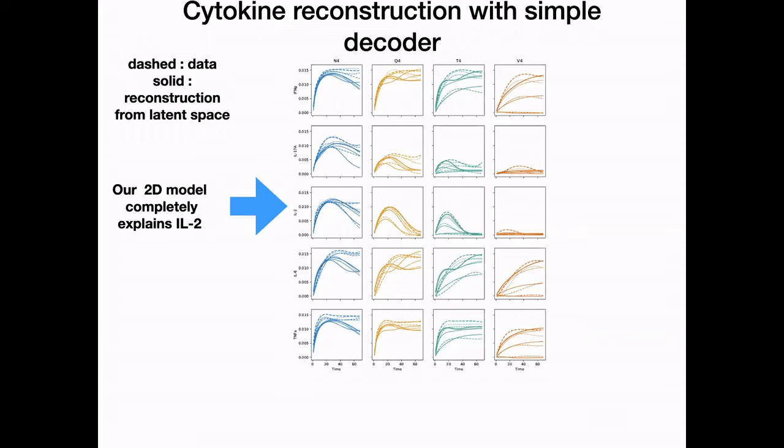That's really good, even though this is quite variable, as you can see. Sometimes it stays flat, sometimes it goes up and down, sometimes there's nothing. In general, also for other cytokines, weaker peptides are quite well predicted. Some of them go up and stay up, and the level where they stay is quite well predicted by our model.